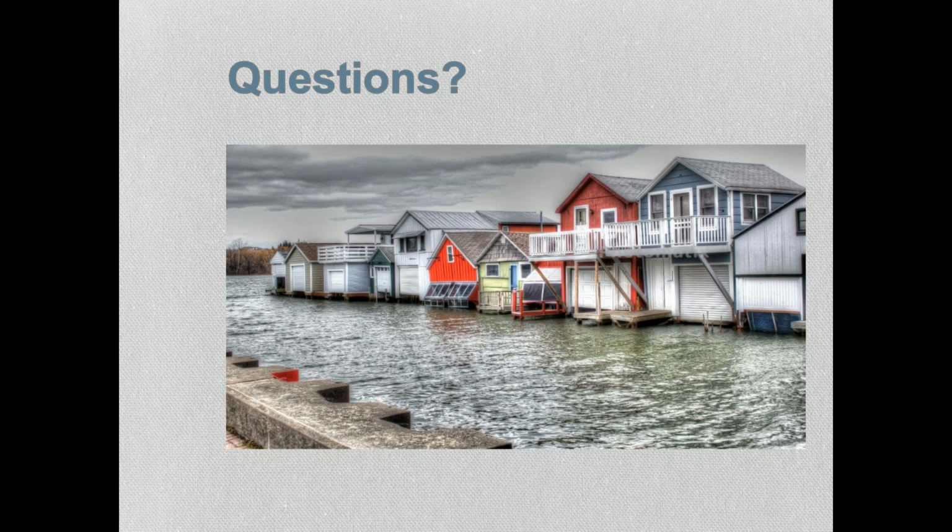Tell us about it. Well, what we do is we ask for dedicated passes. Sometimes when we're up in the endobronchial suite, they'll give us 7 dedicated passes for a cell block. Sometimes they call us greedy. I've been called greedy before. We actually look at the specimen to determine whether or not there's enough in there to spin down. You can visibly see when you get a really good cell block.